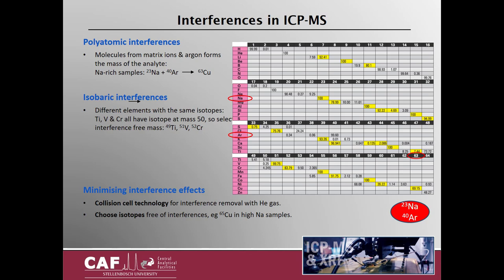Complex processes within the argon plasma can cause some ions from either the sample matrix or the gas environment to recombine and form large new molecules with the same mass as an analyte to be measured. These are called polyatomic interferences. When identifying interferences, you have to consider the isotope masses of all the ions and see how they add up to know on what element mass they will interfere. For example, in sodium-rich samples, sodium at mass 23 can combine with argon at mass 40 to form an interferent at mass 63, which is one of the isotopes of copper.